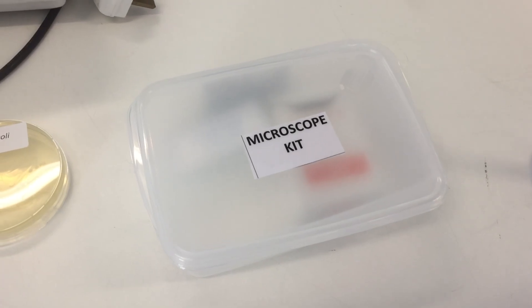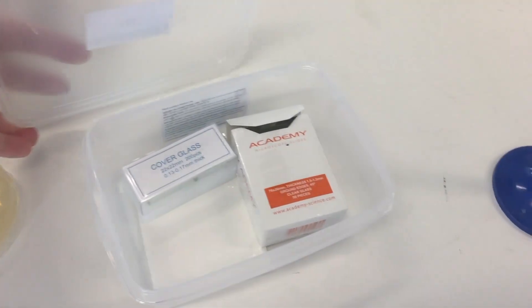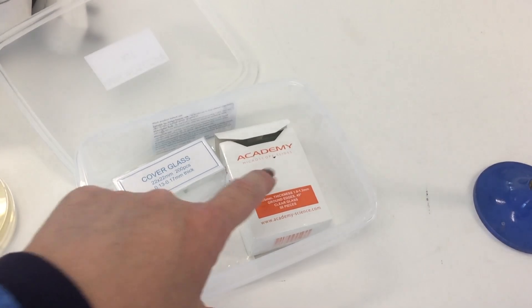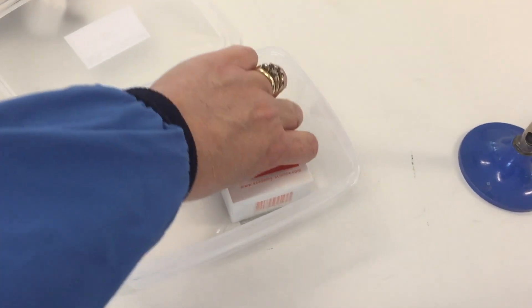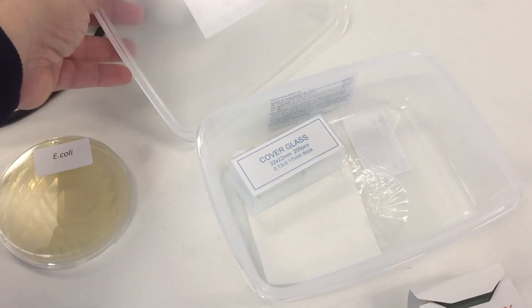Associated with your bench will be the microscope kit. If you open the box, inside you will find lens paper, microscope slides, and cover glasses. Please only use the microscope slides. Cover slips have no role in gram staining.